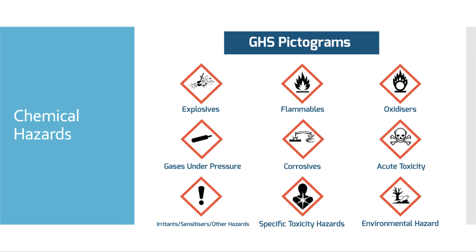So, the different hazards here: corrosive, the most gruesome of all of them, with the picture of the liquid dissolving the thumb on the hand. Acids tend to be corrosives. Bases, the chemical opposite of acids, are also corrosive. If you go out to your family's car and look on the battery, you may very well see the corrosive symbol, because car batteries are filled with sulfuric acid. It's part of how they work. We'll look at that later in the year, but that acid is corrosive.